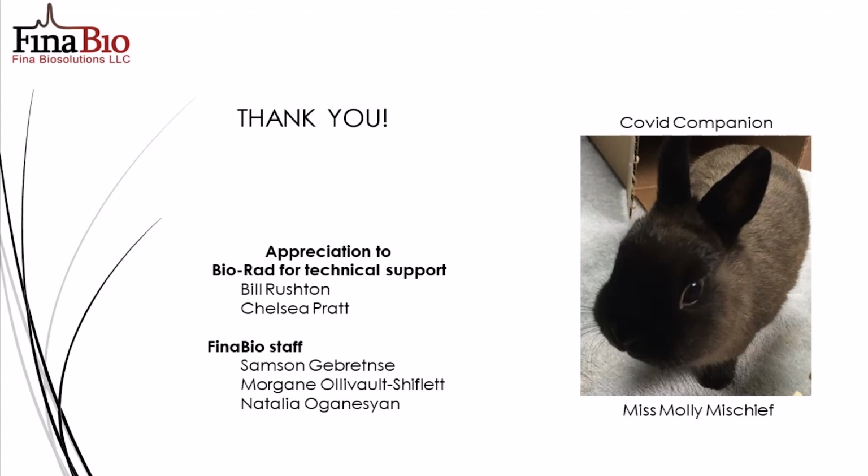And most people have only been able to get about 100 milligrams per liter of the CRM 197 from the Corynebacter cultures. Some companies have developed some high productivity strains, but they're also proprietary. Once it began to appear in other bacteria, notably in Pseudomonas, I would say it's as much a business decision to keep the price high.